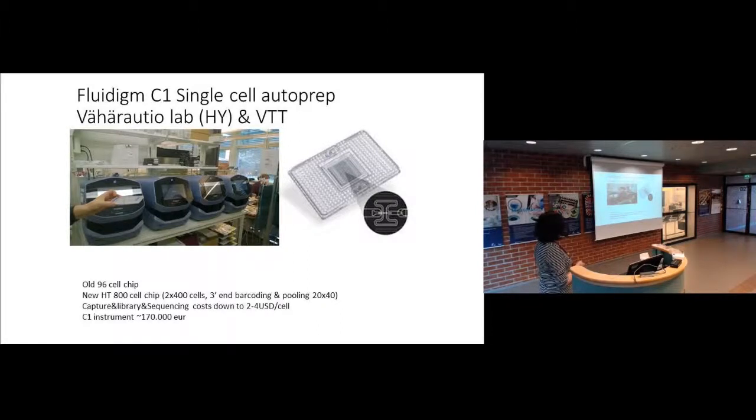Then the rest of the cells are washed away, and then they move to separate chambers for lysis and cDNA synthesis in the reverse transcription, and you can add the different reaction mixtures to those tiny chambers for each cell. And then in the end you take out from output wells the 96 different amplified cDNA libraries, and then you have to do the indexing of them and add the barcode afterwards, just outside of the chip in the 96 well plate.